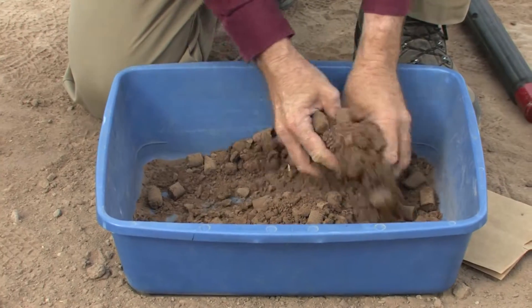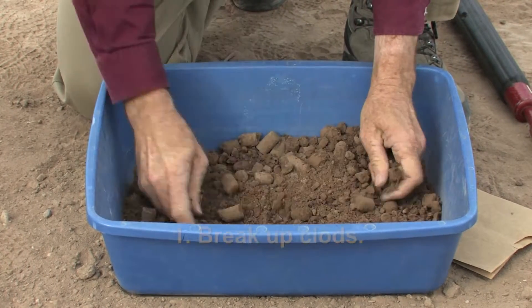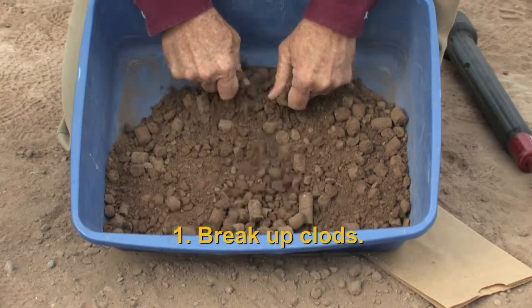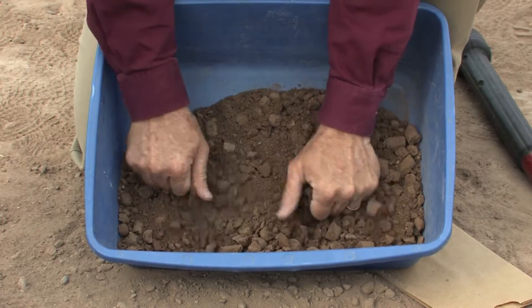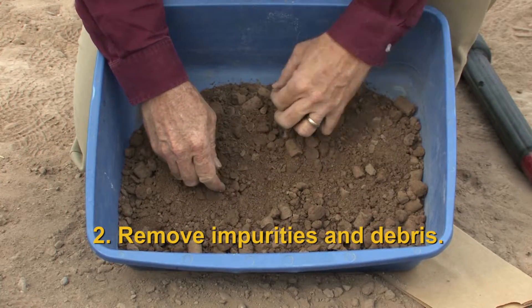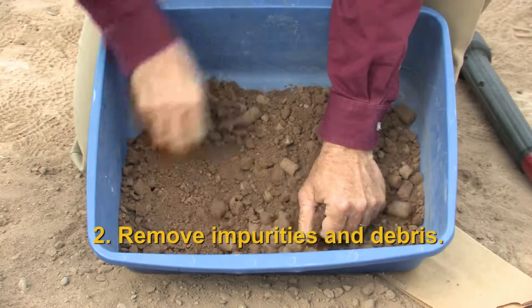Once we've collected our soil sample, we need to ensure that all of the little clods that occur from our sample probe are broken up. In that process of breaking up the clods, we're looking for any impurities — rocks, any debris, anything from the soil surface like sticks or corn stalks depending on the field. You'll notice that they're being thrown out because we don't want them in the sample.